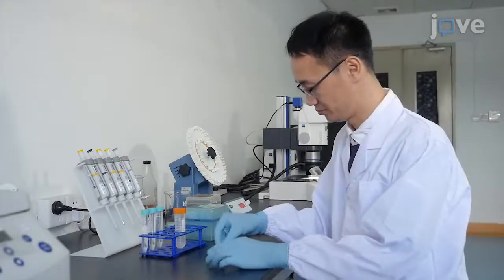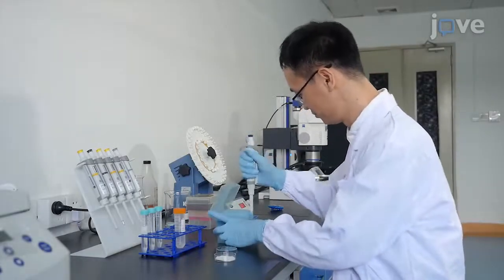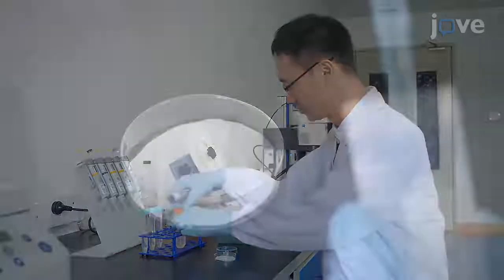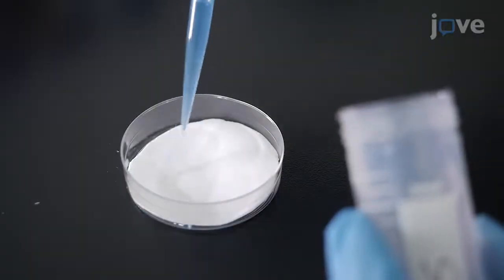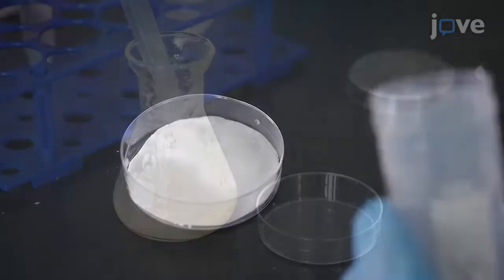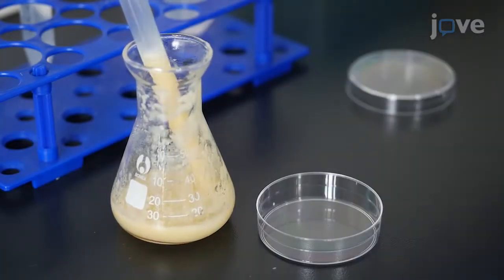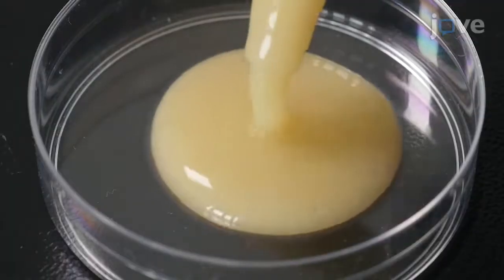Before initiating the starvation treatment, place an appropriately sized piece of filter paper into a 6 cm Petri dish and add 1 ml of PBS onto the paper to create a starvation chamber. To make a control treatment chamber, place 5 ml of Bloomington Standard Cornmeal food into a 6 cm Petri dish.